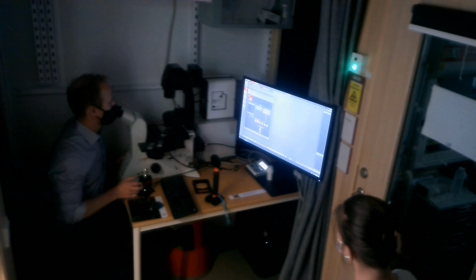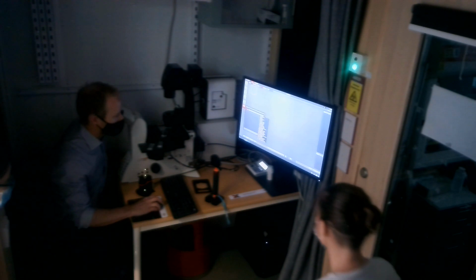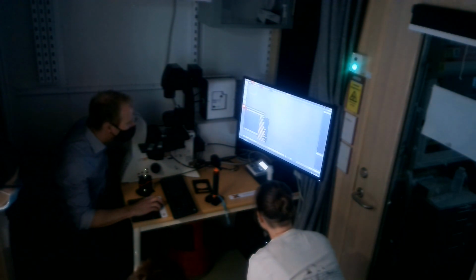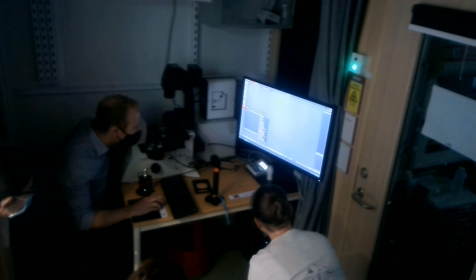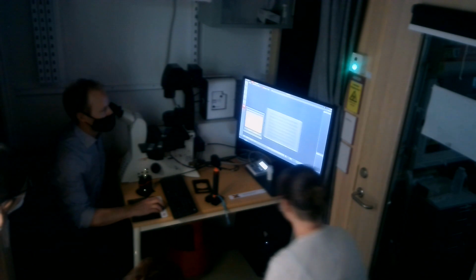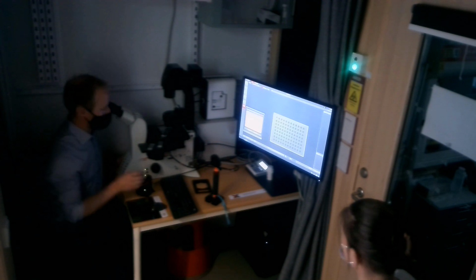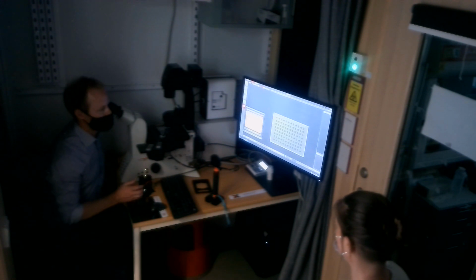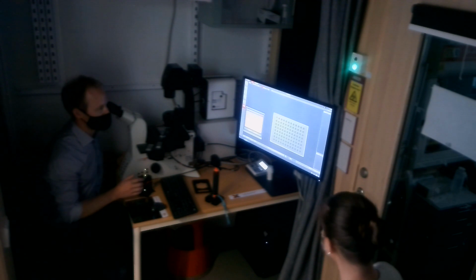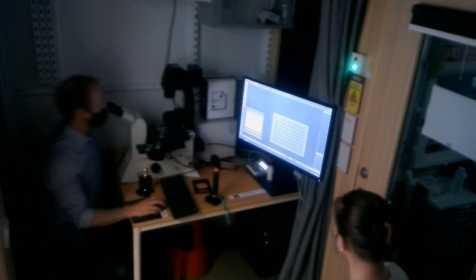So this is also a time when, if you would add this in here, let's take just one random one. Take someone whose name I recognize. So if you have this, it's very good because then you can quickly move by just clicking on it, and you know that you're in the right position. With the 96 well plate, if you want the alignment to be absolutely exact, it's good, but with this one it will more or less be in the correct position, depending on how sensitive it is. So I will go here and hope that I'm more or less in that position.